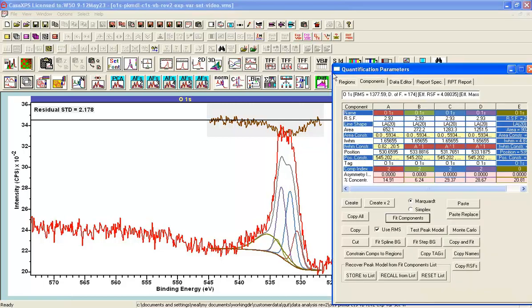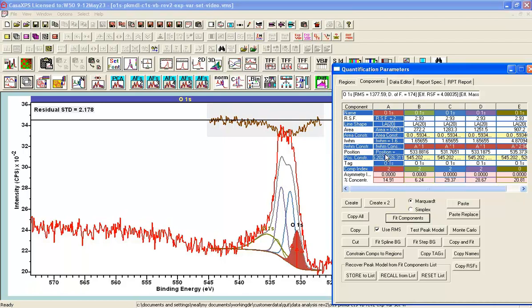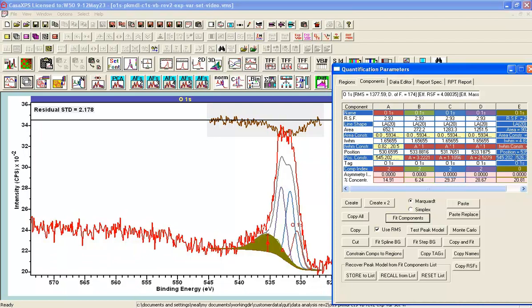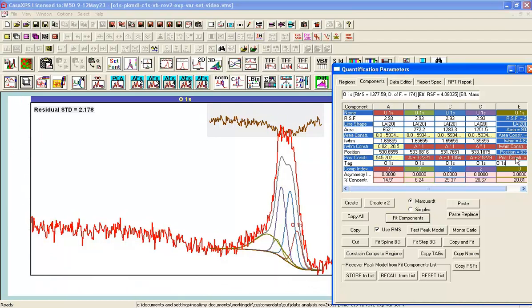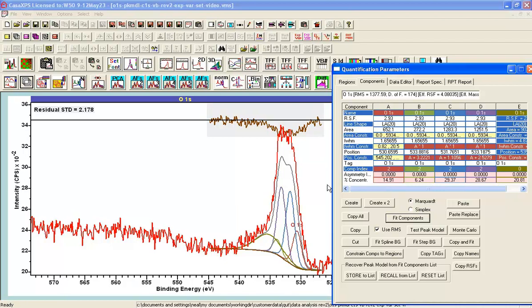Let's make use of this peak model — defined by the entire data set — and apply it to the whole set without seeing too many variations. We can do that by introducing more constraints. We can add a constraint to the peak representing the shake-up and also lock all the positions. The shake-up peak has a different component index, so we handle that separately.